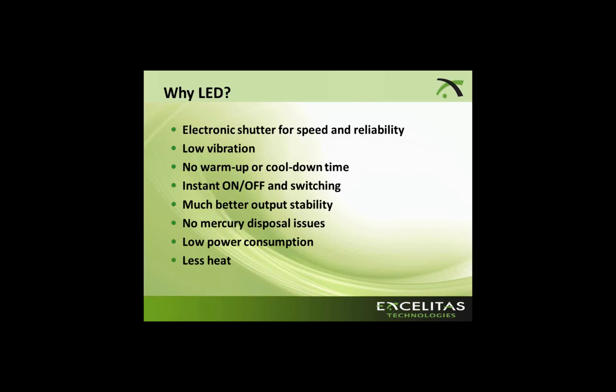LEDs, on the other hand, do not have to stay on the entire time that you are doing your imaging. The reason for this is because they have instant on and off, and it's an electronic shutter versus a physical shutter. And what that means is that you apply current to the LED, light comes on, you turn off the current to the LED, the light goes off, and you can also vary the intensity by altering the amount of current reaching the LED. Because of this technology, you can also switch between one color and the other color if your LED has several colors.